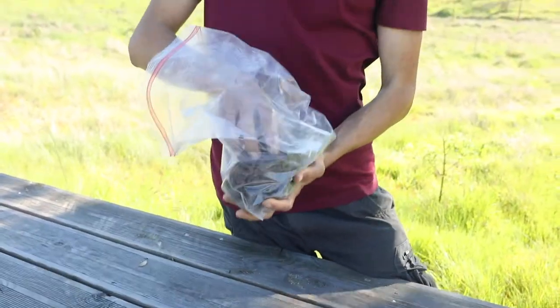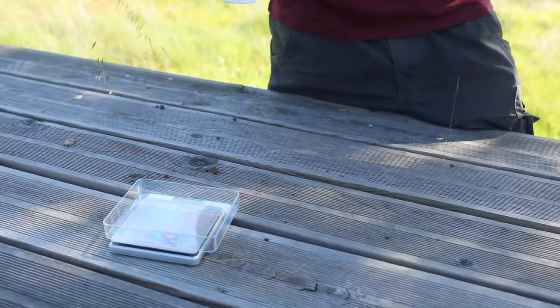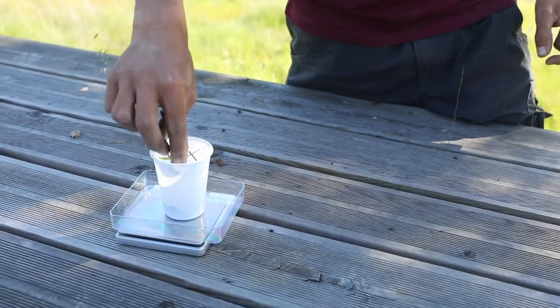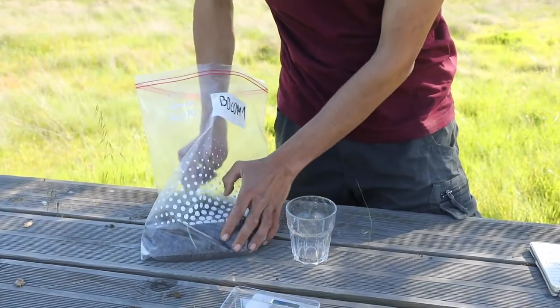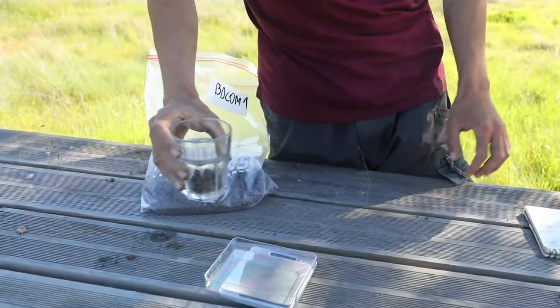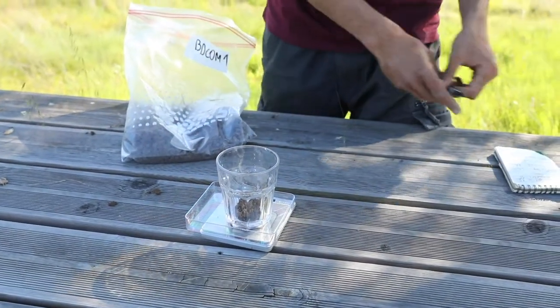We then mix our sample thoroughly by kneading. Then we weigh an empty cup and record its value on the datasheet. We take a little scoop of about an eighth of a cup of loose soil from our bag and place it in the cup. Finally, we weigh the subsample in its cup and record the value on the datasheet.